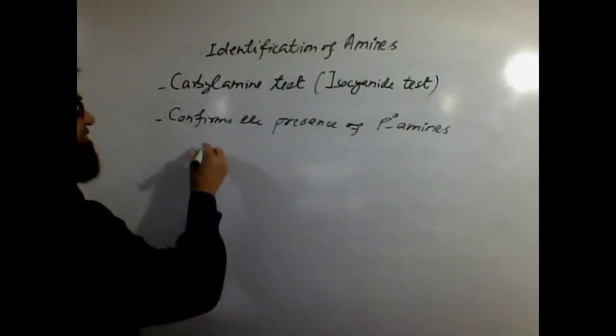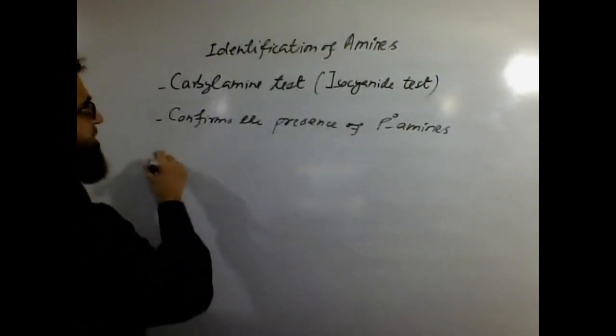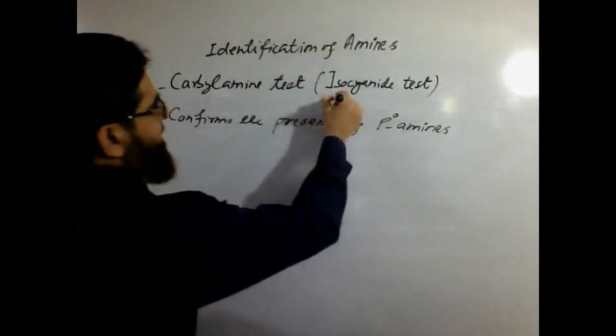So what happens actually in this test? Isocyanides are formed.